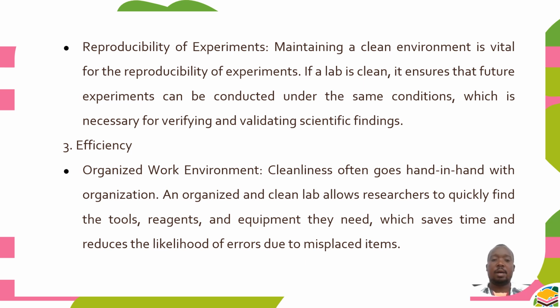It also ensures efficiency, an organized work environment. Cleanliness often goes hand in hand with organization. An organized and clean lab allows researchers to quickly find the tools, reagents, and equipment they need, which saves time and reduces the likelihood of errors due to misplaced items.